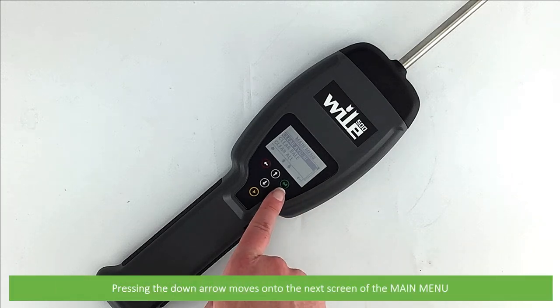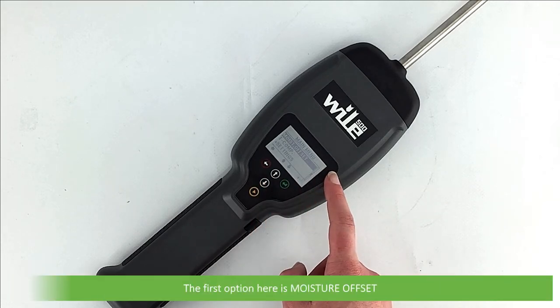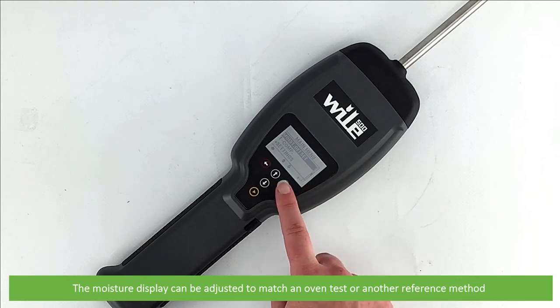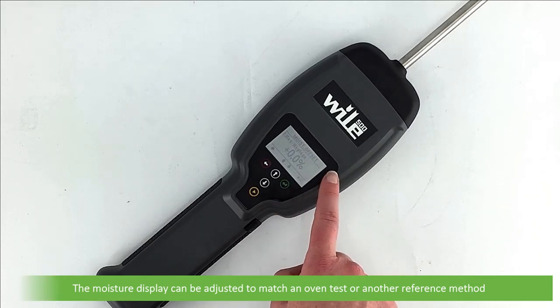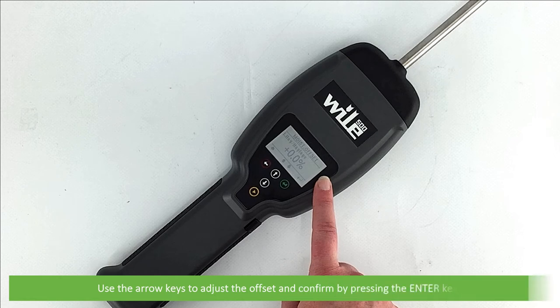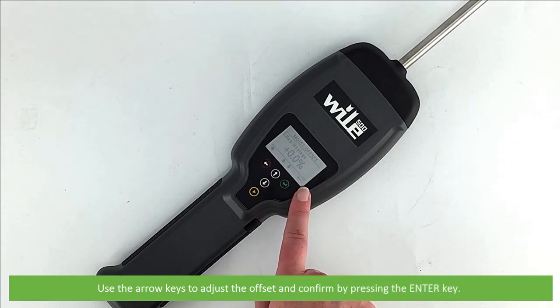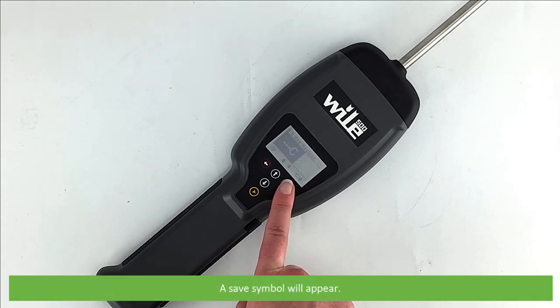Pressing the down arrow moves to the next screen of the main menu. The first option here is moisture offset. The moisture display can be adjusted to match an oven test or other reference method using this setting. Once set, an offset correction will be applied to all moisture measurements of the same type including results already saved in memory. Use the arrow keys to adjust the offset, confirm by pressing enter, and a save symbol will appear on the screen.